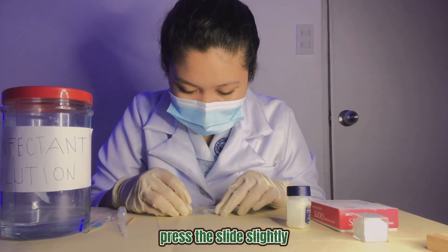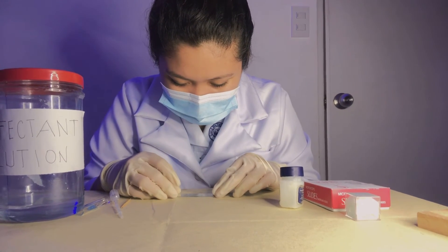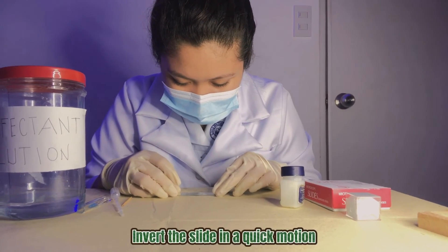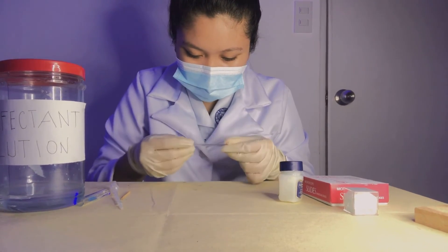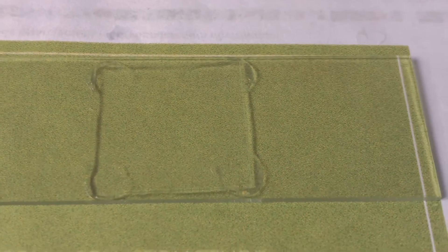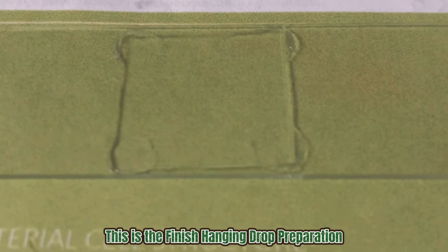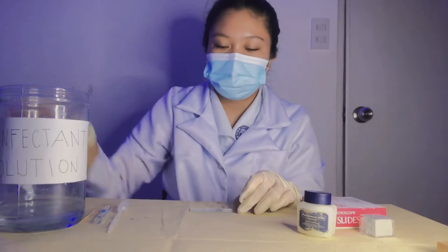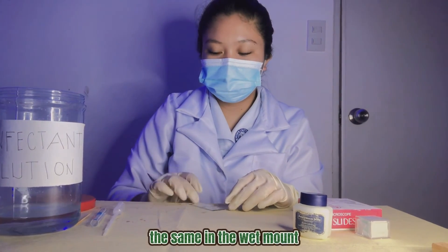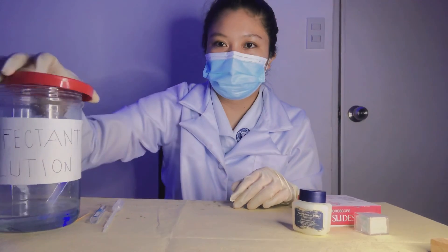Press the slide slightly onto the cover slip. Revert the slide in a quick motion to keep from disrupting the drop. This is the finished hanging drop preparation. Same as in the wet mount, discard the preparation into a disinfectant solution.